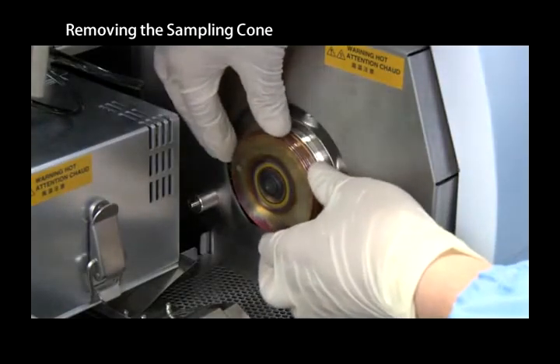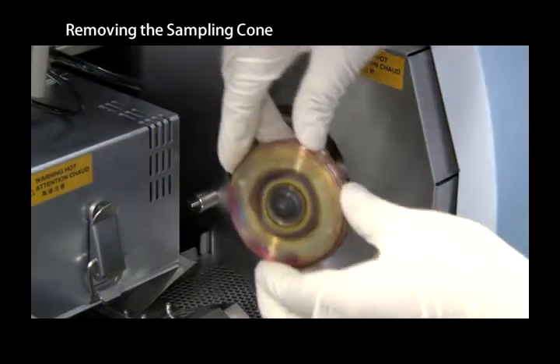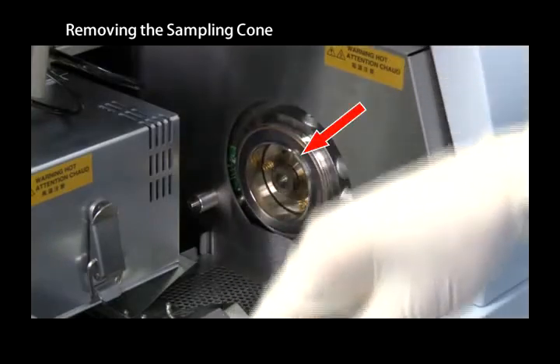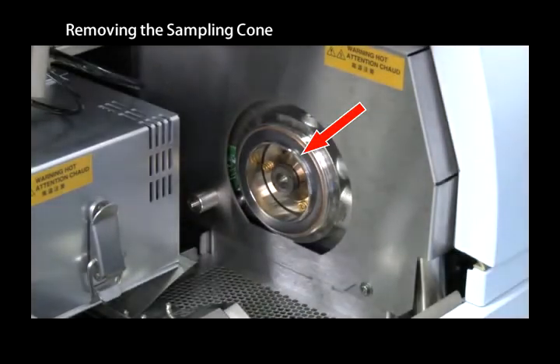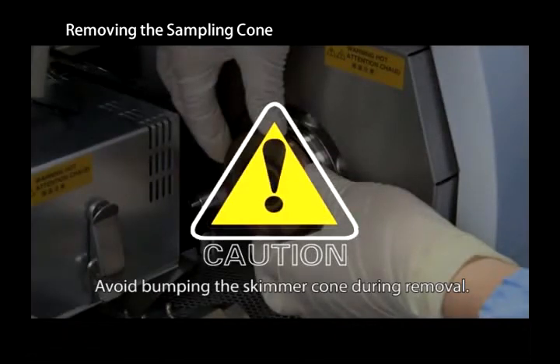Hold the outer edge of the sampling cone and slowly pull it out along its axis. It is not necessary to remove the graphite gasket. Take care not to bang the sampling cone against the skimmer cone during removal.